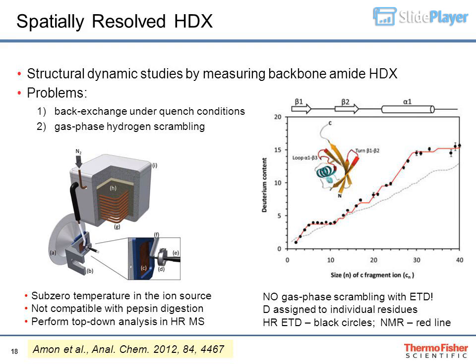Error bars represent average plus/minus SD for measurements made in triplicate. NMR deuterium levels were obtained from exchange rate constants determined by Johnson et al., ref 39.